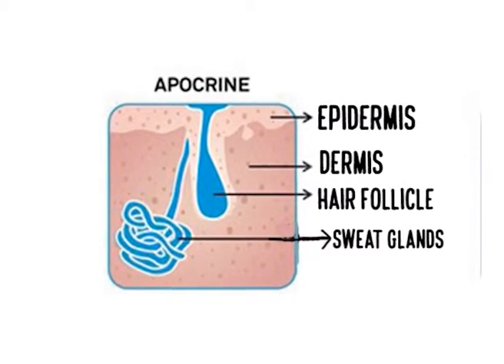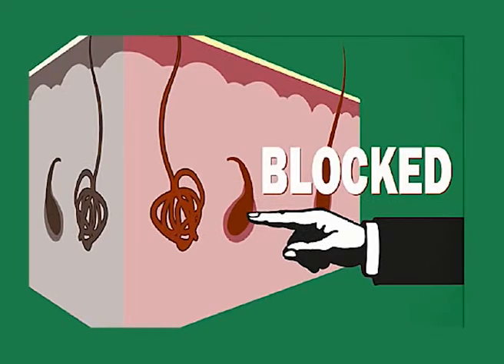The amino acid content of sweat residue may be fixed by treating the latent fingerprint with a solution of Ninhydrin reagent. The amino acid Ninhydrin reaction produces a purple compound called Ruhemann's purple, which gets deposited along the ridges, making the latent prints visible.